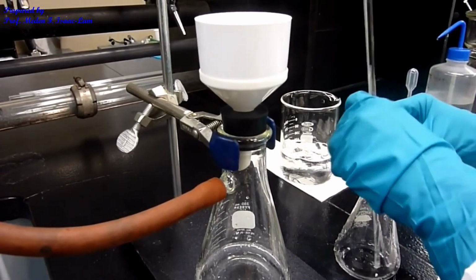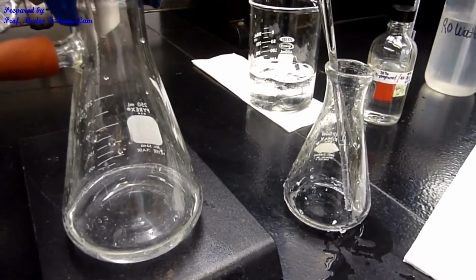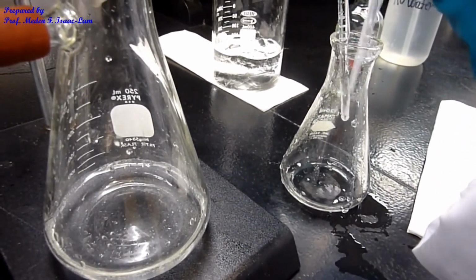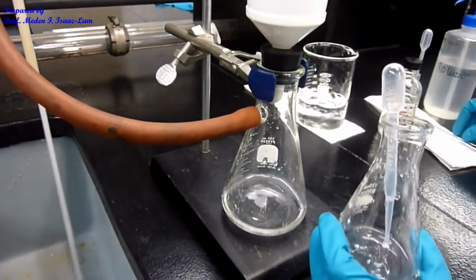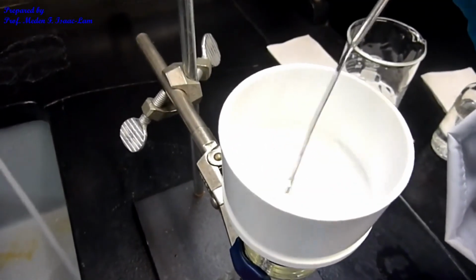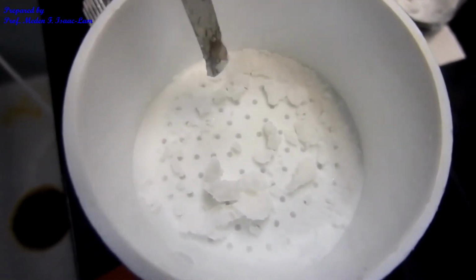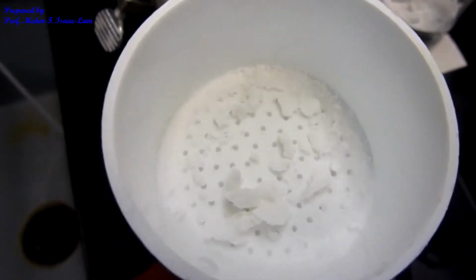So I'm gonna use a pipette. What I'm trying to do is clean that precipitate as much as possible. Okay, so now it's a cleanup procedure.